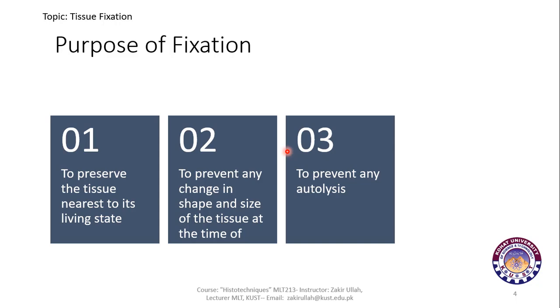When fixation is performed, it stops any sort of autolysis, any sort of proteins or enzymes released from the cells. This stoppage of autolysis is also important to maintain the cells nearest to their original living state.